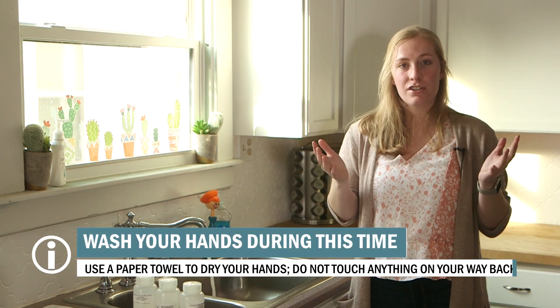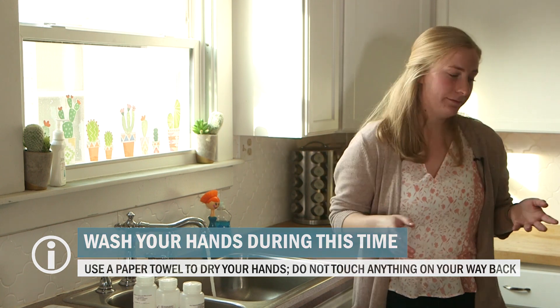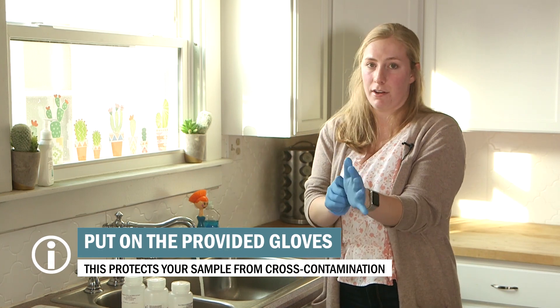During this time, go wash and dry your hands at a different sink. Be careful not to touch anything on the way back. After three minutes, return to the sampling location and put on your gloves.